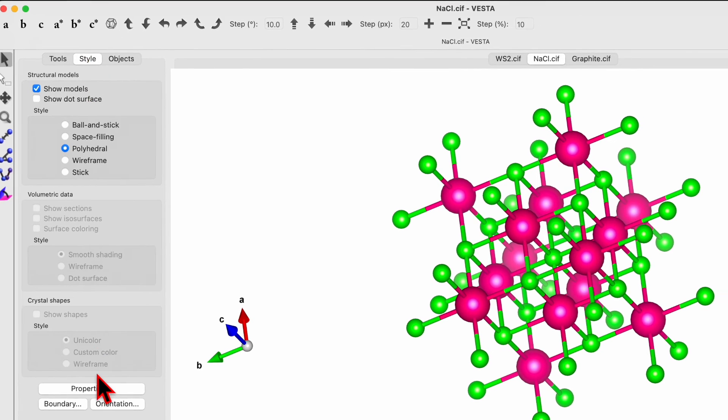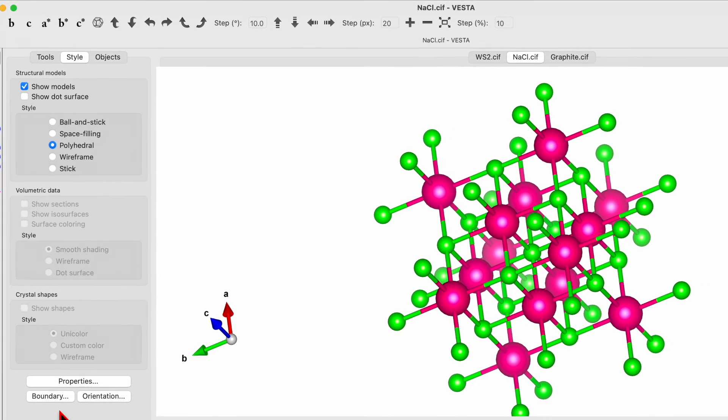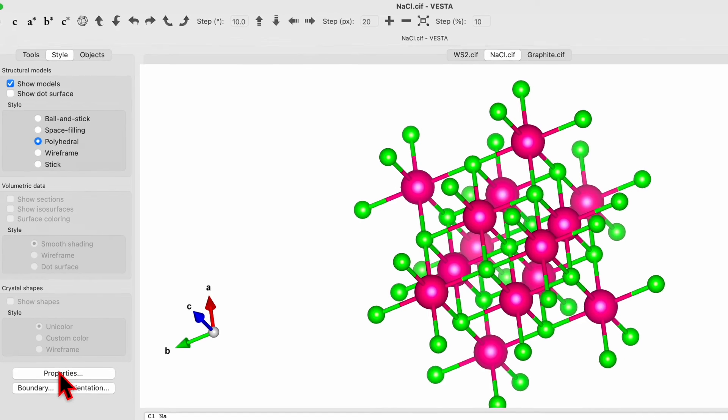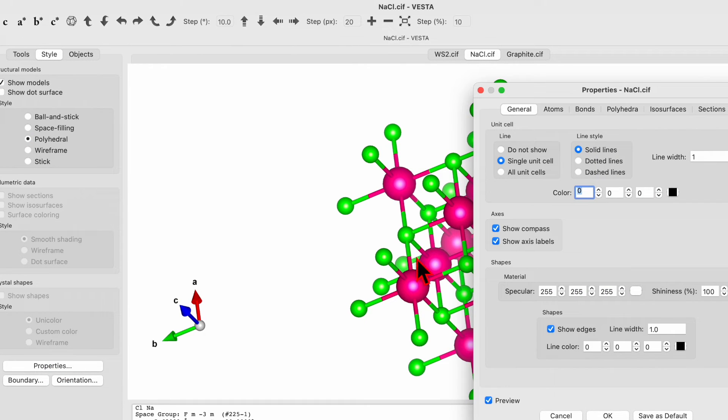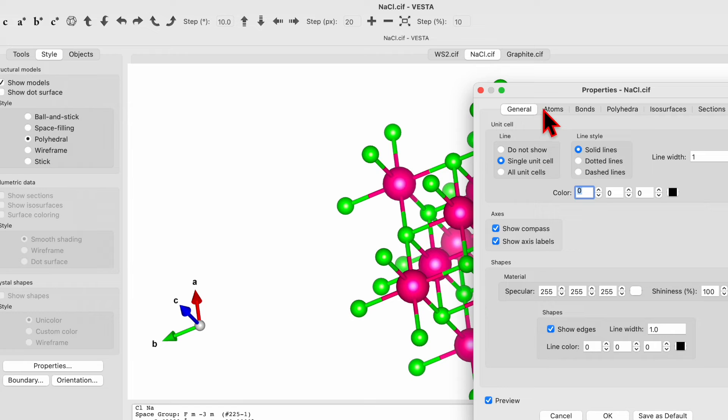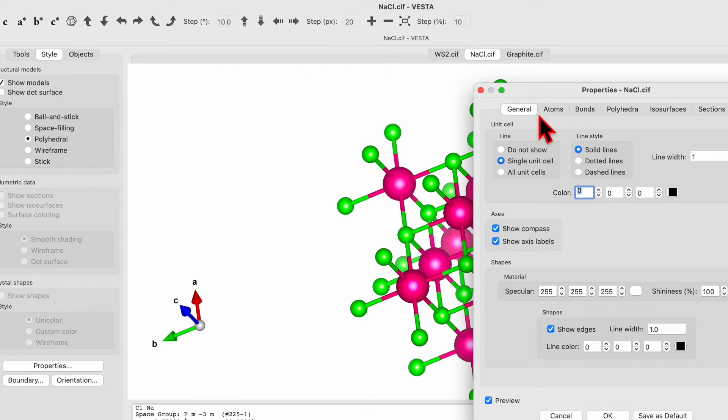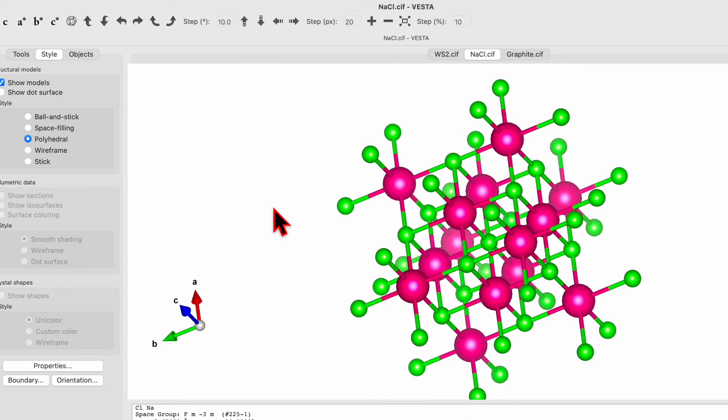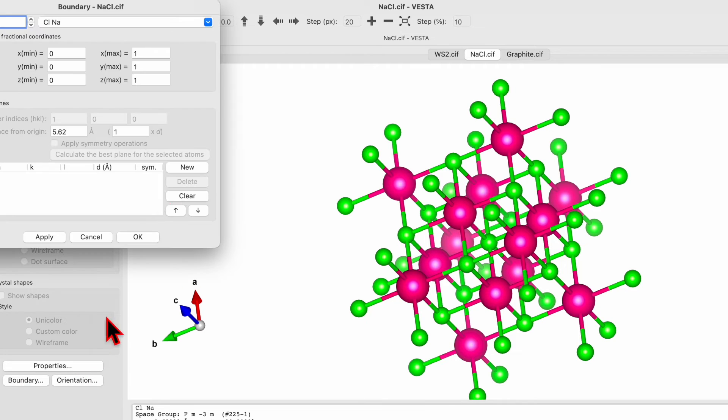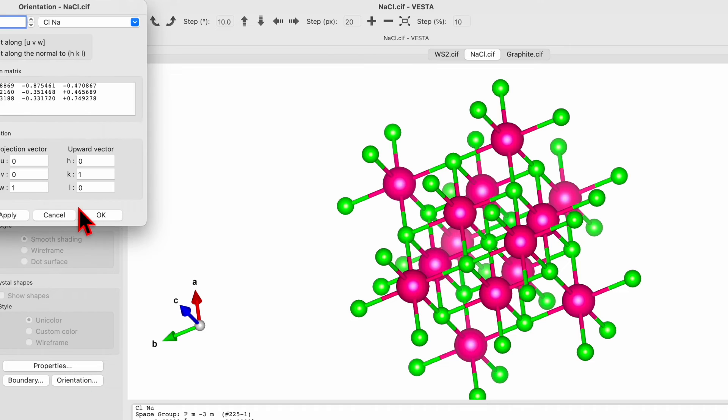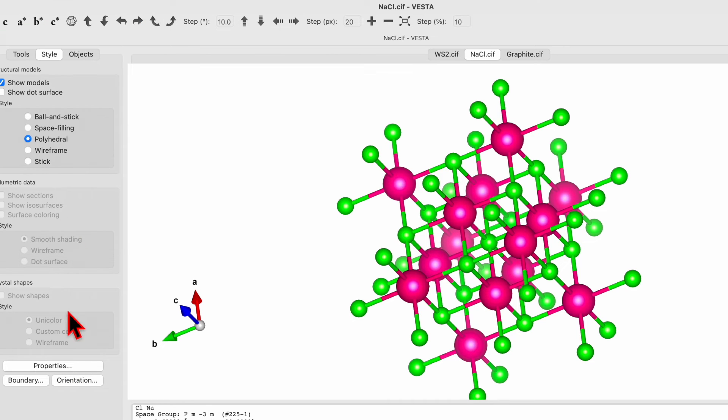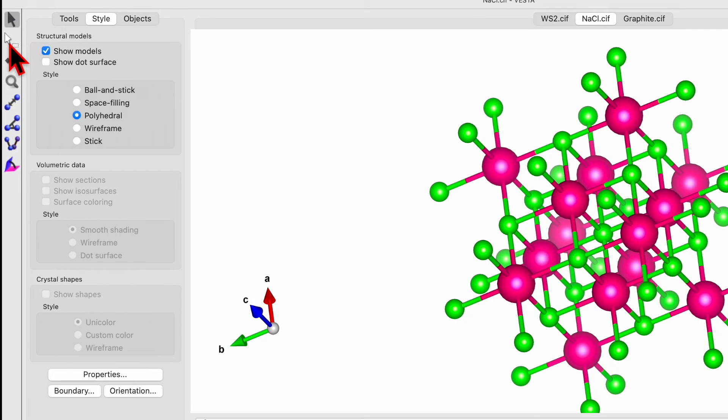And then in the bottom side, you will see properties. If you click on this one, it will show different properties: general, atom, bond, polyhedra and so on. I will cover this topic in next coming videos. So then there is option for the boundaries and also for the orientation. So I will discuss about those options in coming few videos.